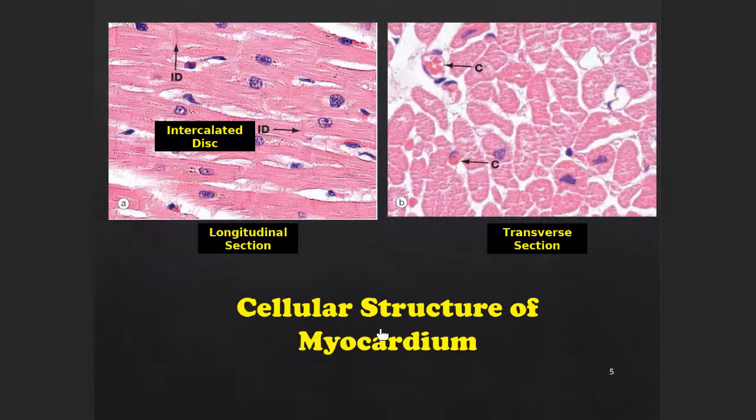Third is your myocardium. Now see, these all are your intercalated discs. Intercalated discs are one of the features that you will see in cardiac muscles. And this is again a transverse section picture in which you can see the muscle fiber. So this is your cardiac muscle fiber, and this whole structure is your myocardium. In this you will see the nucleus toward these structures. And this C is your capillary, containing red blood cells, and this is your single line of endothelial cells.